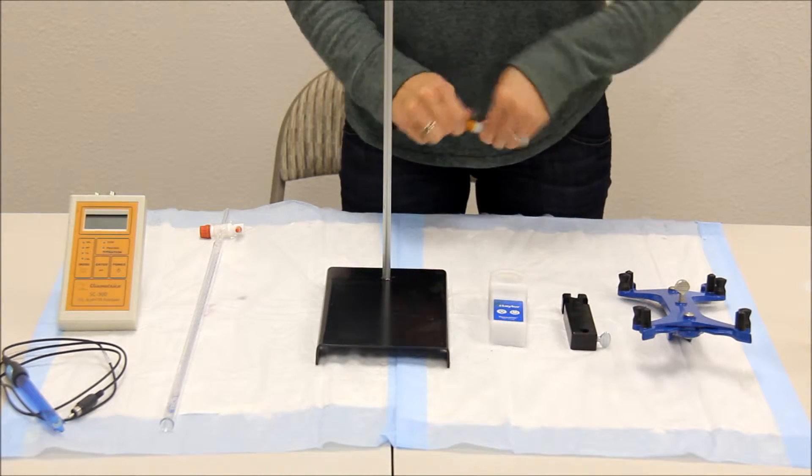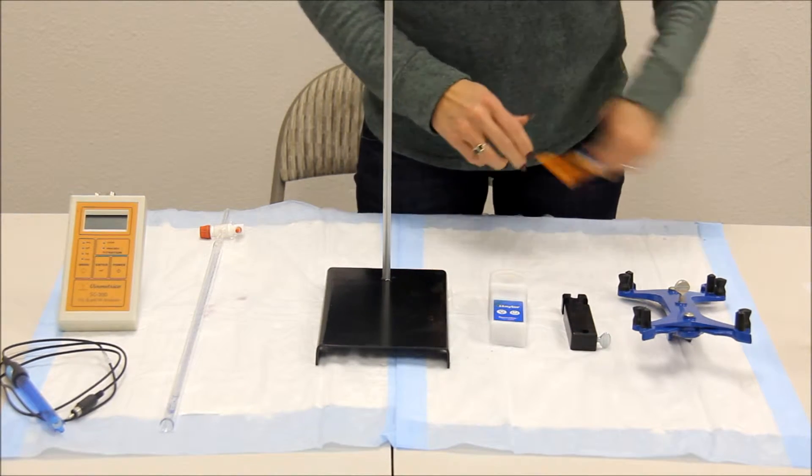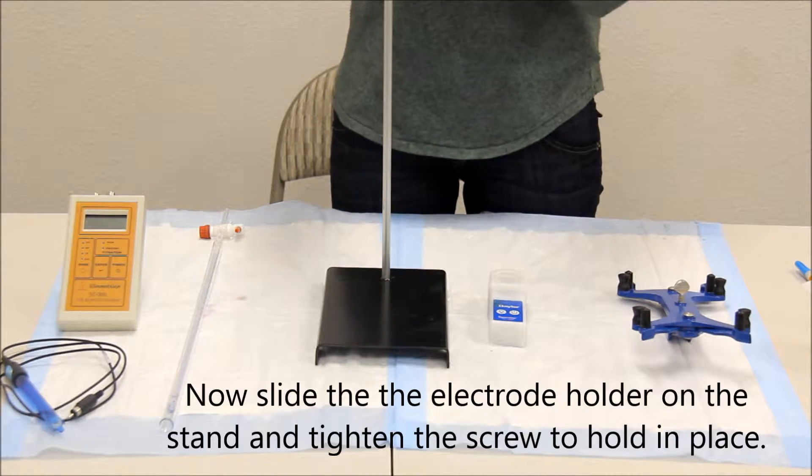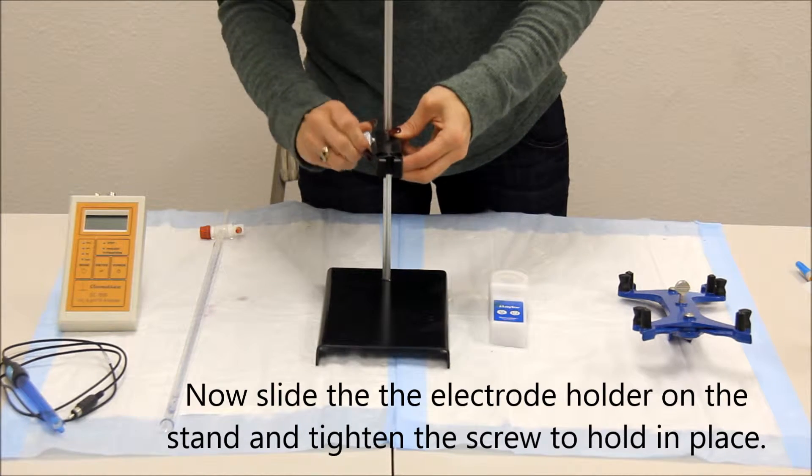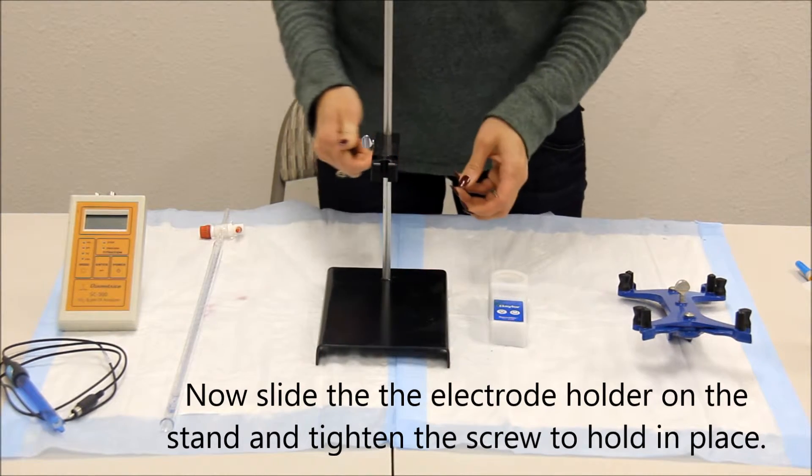You will now place the electrode holder and tighten to clamp down.